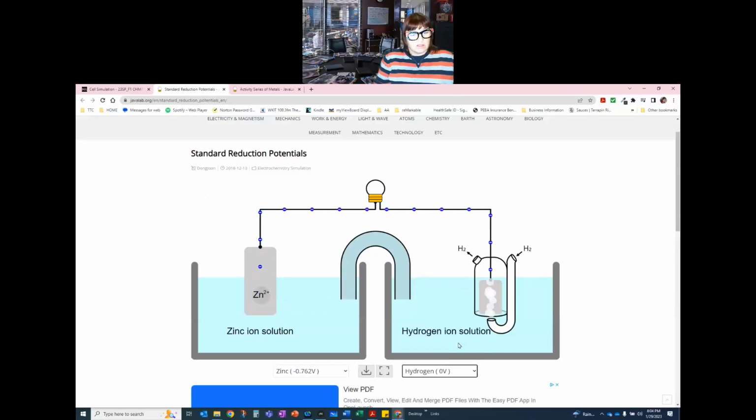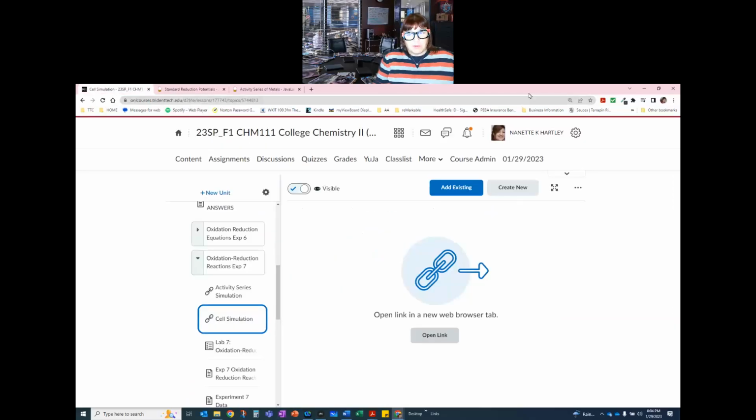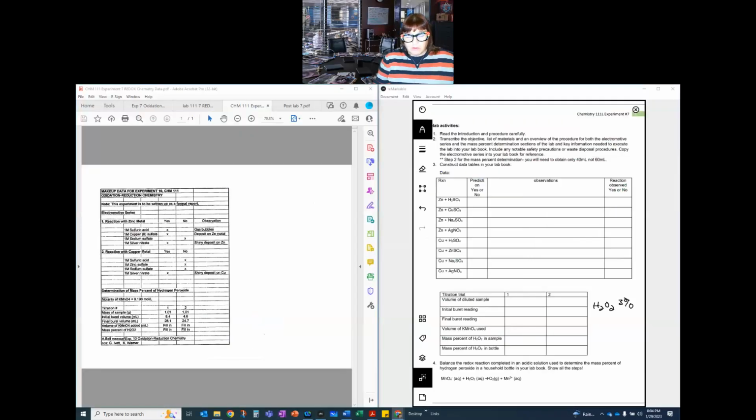Then I can look at the things that I don't have. What I see here is it's coming off as 2 plus. Those simulations should be able to give you all the information you need to be able to make your own observations. I would prefer to make your own. But if you are not comfortable with that, or if you're doubting yourself, here is data about what should have been.